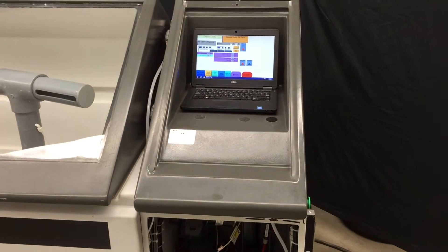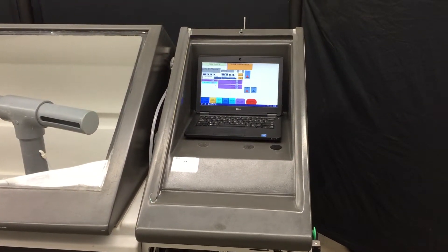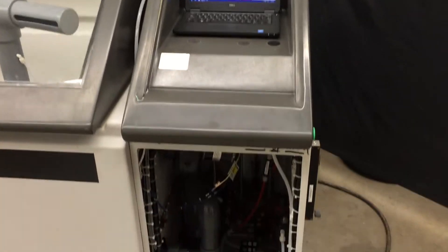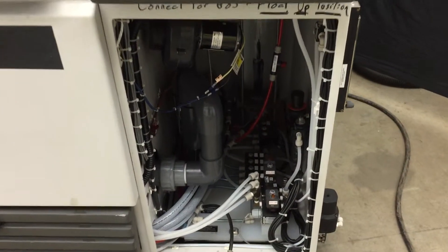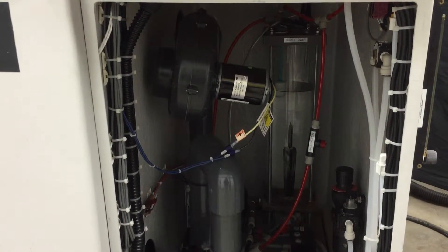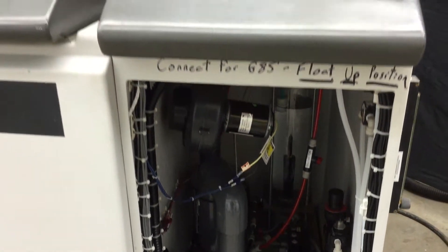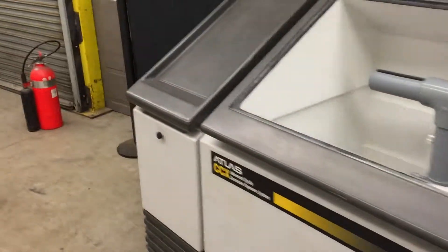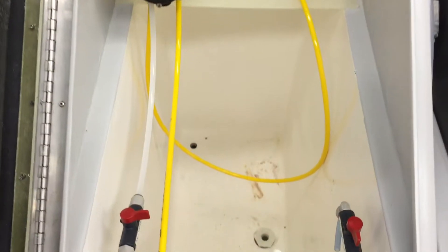The right side of the machine is where all the control circuitry is — the laptop controller, some pneumatic valves, piping, the purge blower, and the bubble tower. On the left side is the solution tank.